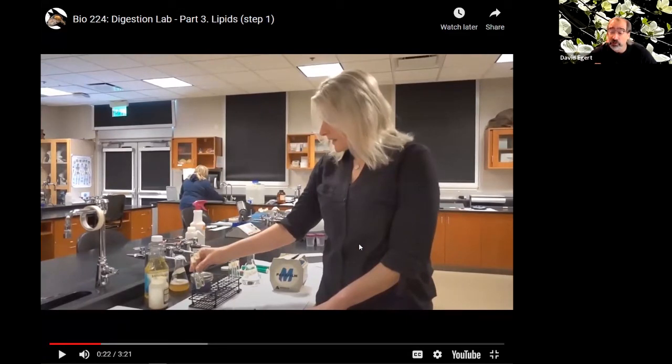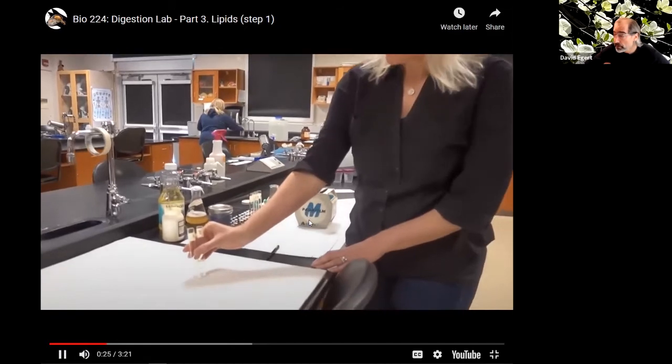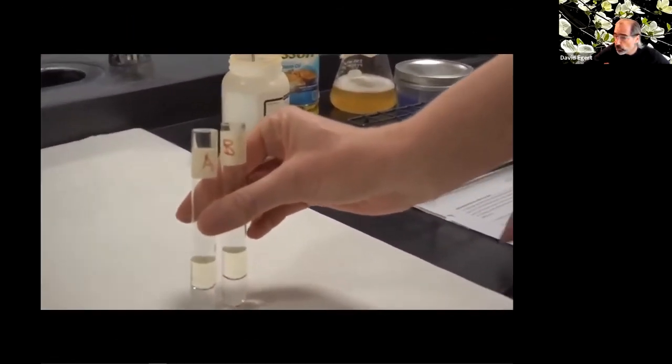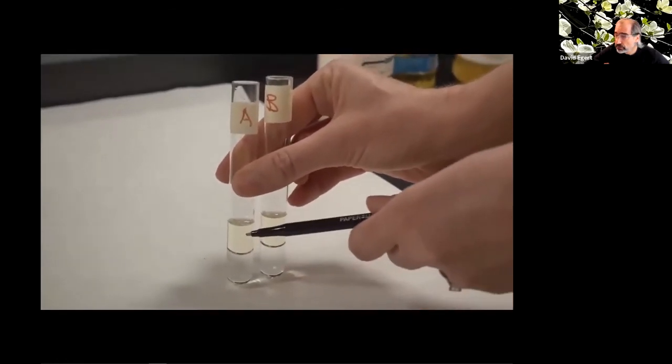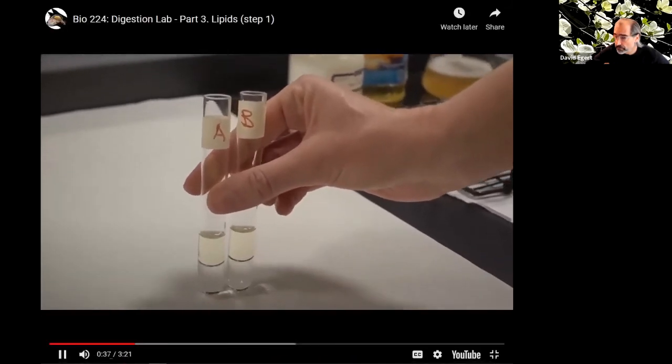So here I have 2 test tubes labeled A and B. I have added 3 milliliters of water and 3 milliliters of oil. The water is at the bottom and the oil is on top. Both test tubes have the same.